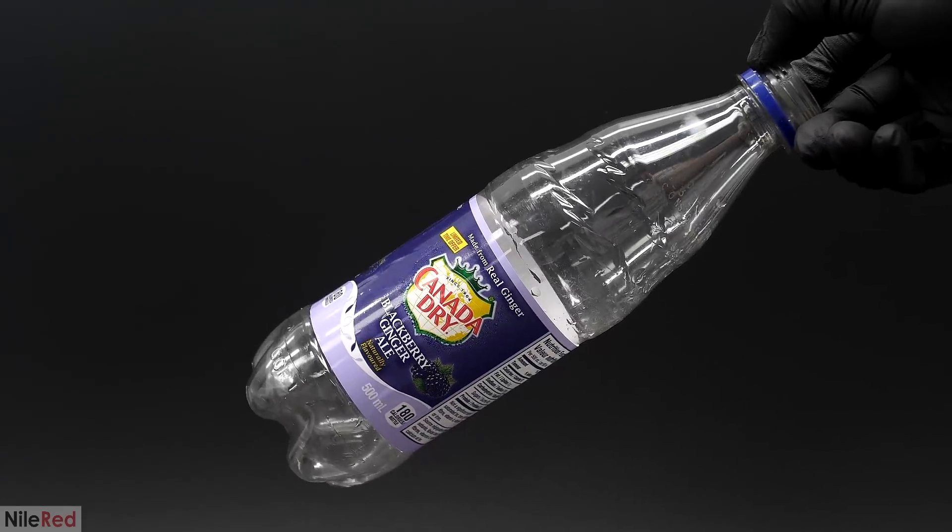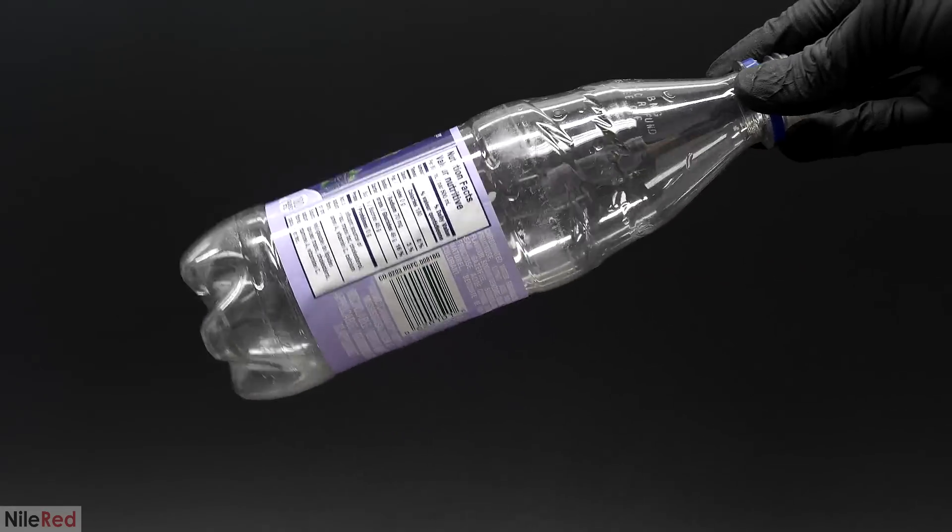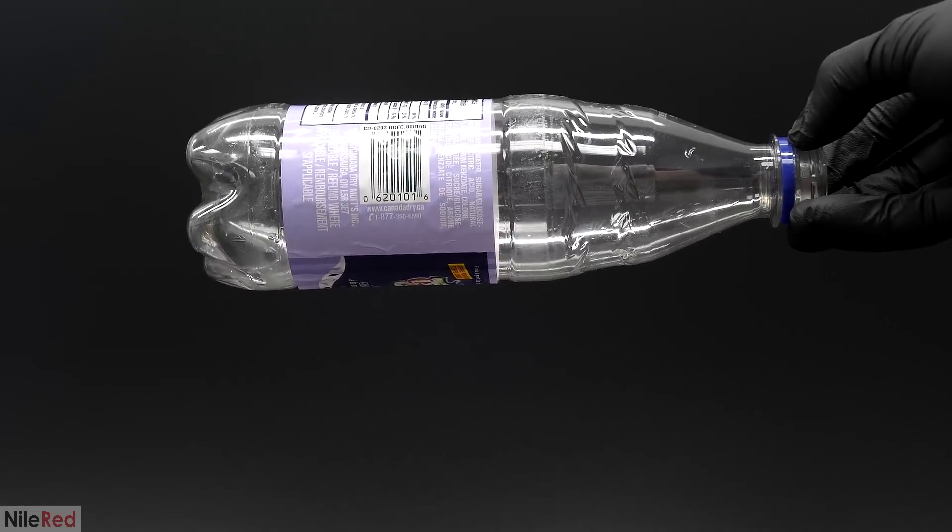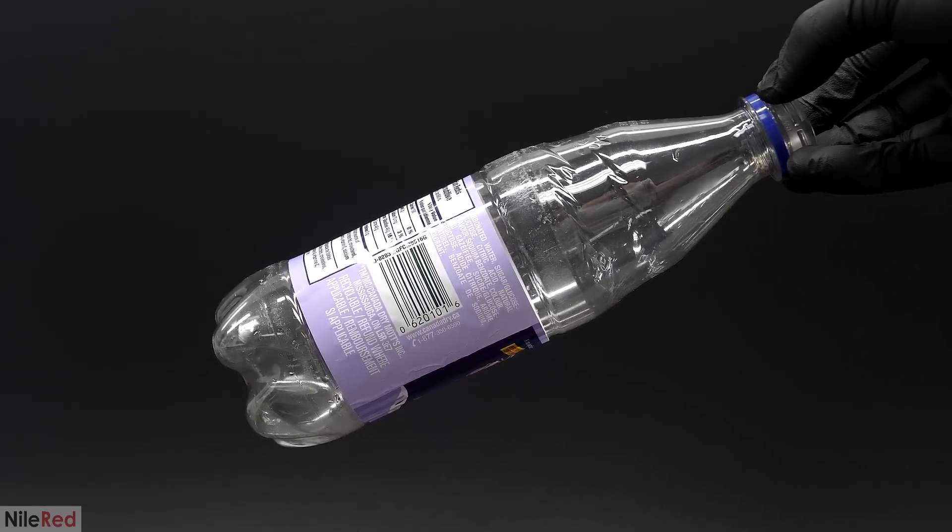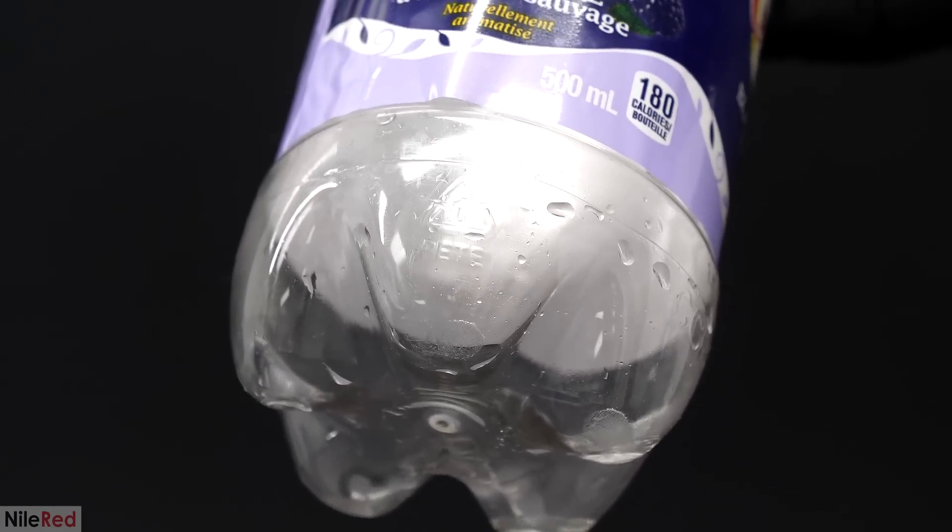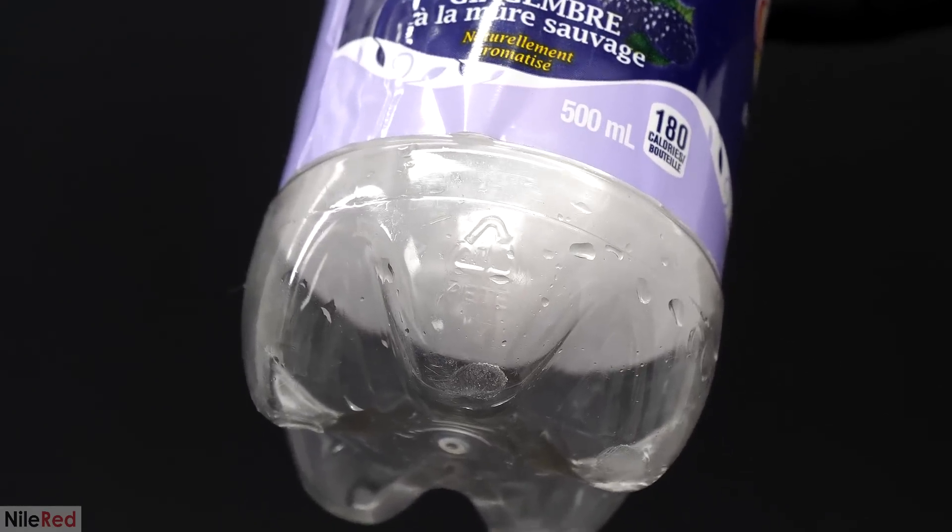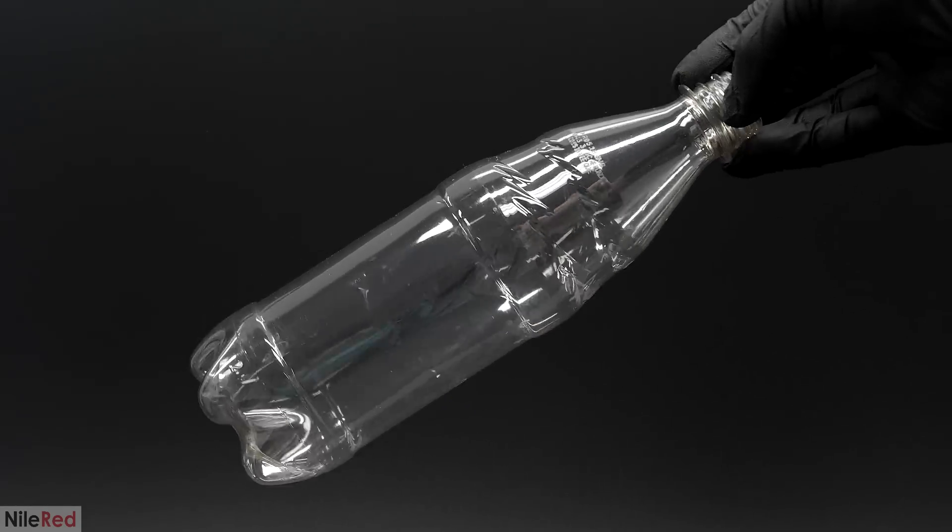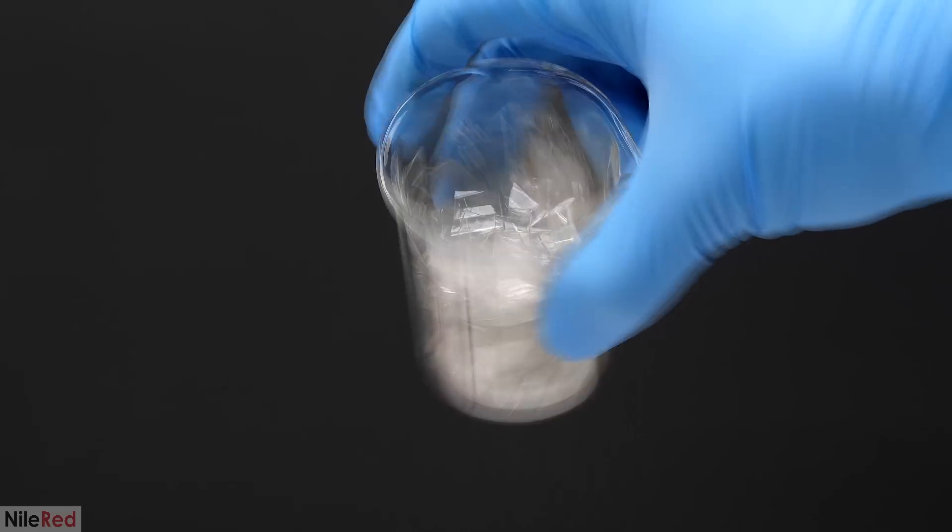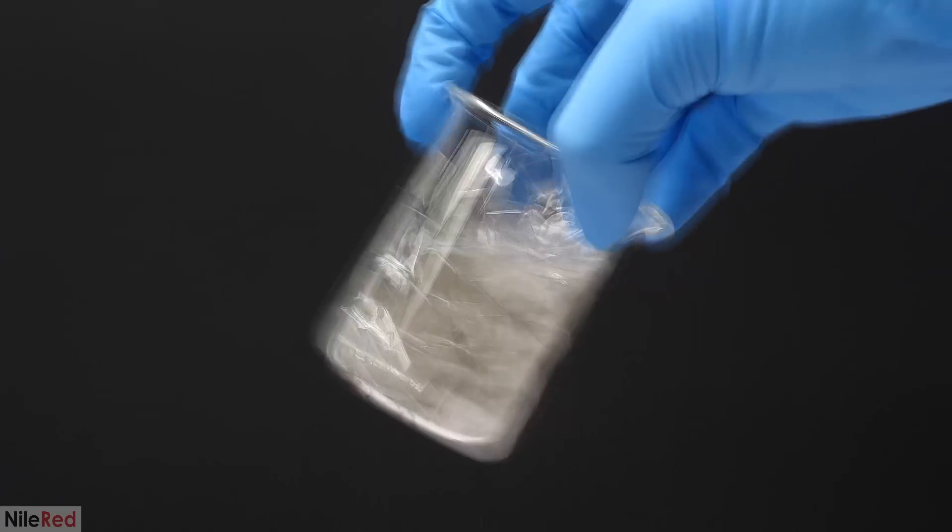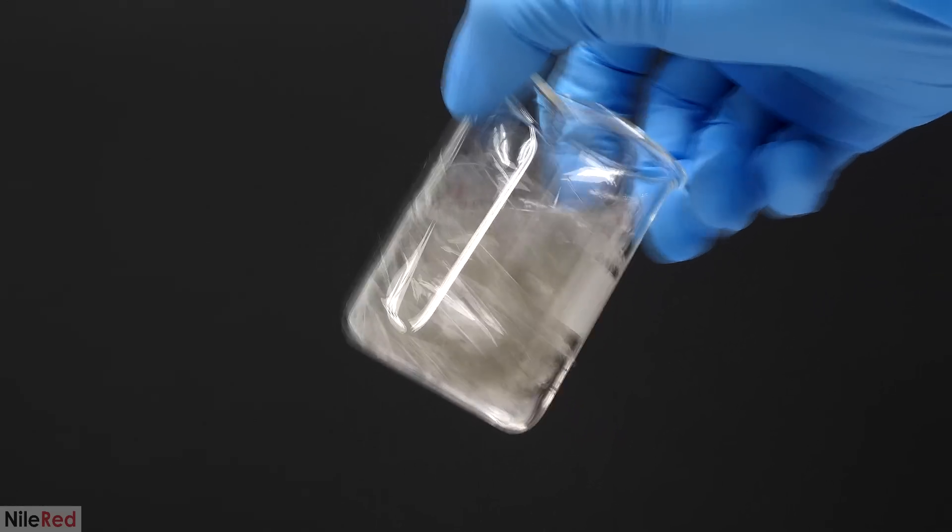Besides the chemicals, I of course also needed a plastic bottle. Pretty much all water and soda bottles should work, but it is a good idea to check that it's actually PET. This is very easy to do by just looking for the recycling number, and it should either say 1, or sometimes it's even just literally written PET. I took off the label, cleaned off all the glue, and then chopped it into pieces using scissors. I also weighed it out, and in total, there were 22.5 grams of plastic here.